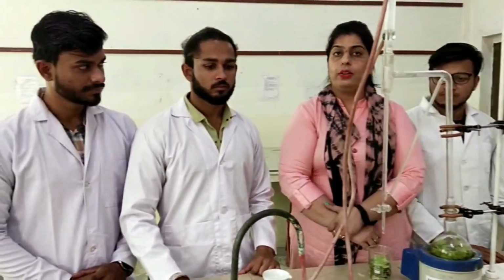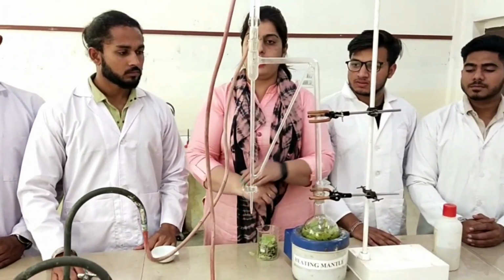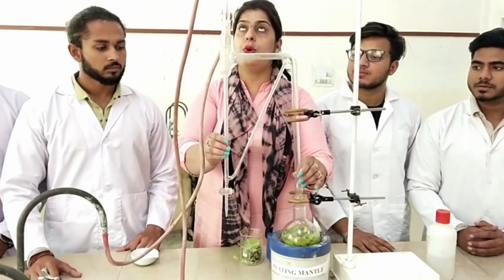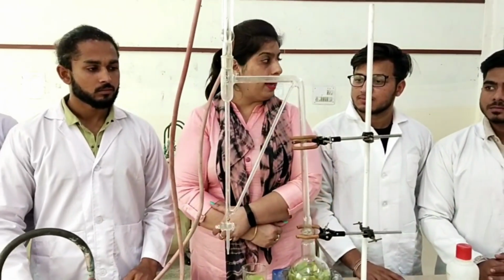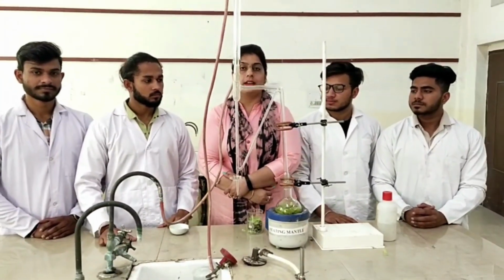oil. So this was all about the Clevenger apparatus. Hope you have understood how to isolate volatile oil with the help of the Clevenger apparatus. So that was all about the Clevenger apparatus.